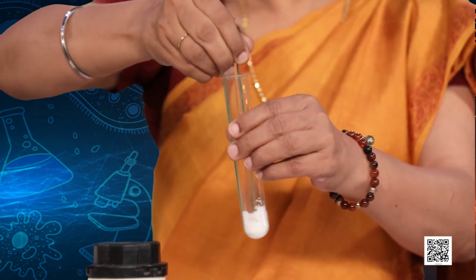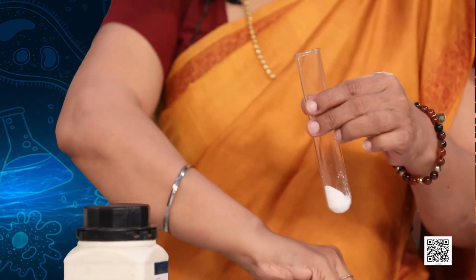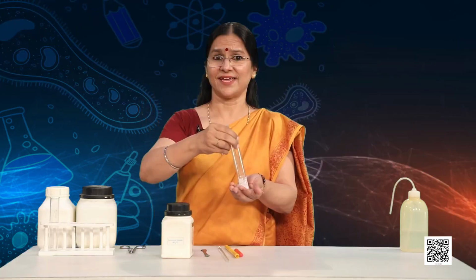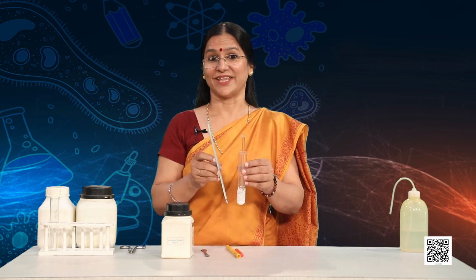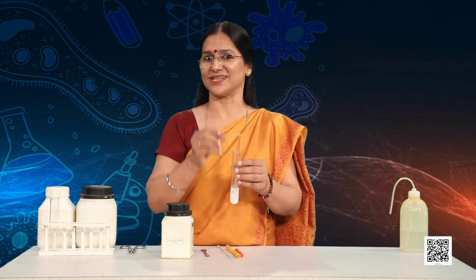And children, always remember to use chemicals judiciously because they harm the environment. And this can very easily be felt by visually impaired students. They can feel the change in temperature. I can feel it has become cold. You can also check and verify by using a thermometer whether the temperature has decreased or increased. Now tell me, here is a small task for you, whether this is an exothermic or endothermic reaction. And yes, I can also smell some gas. What gas could it be?